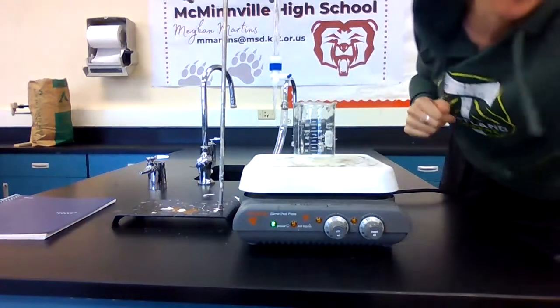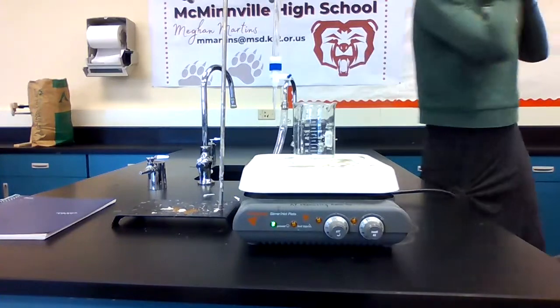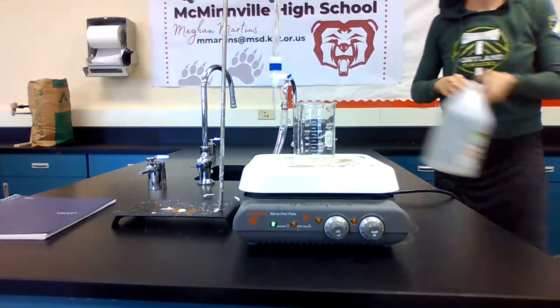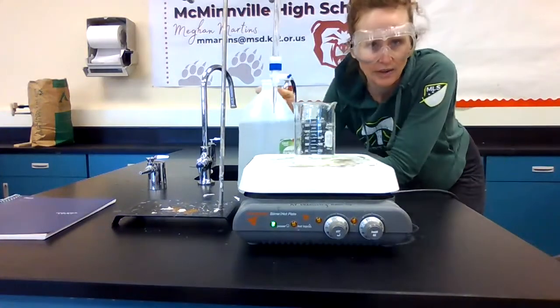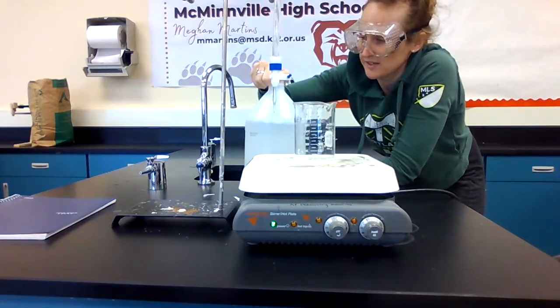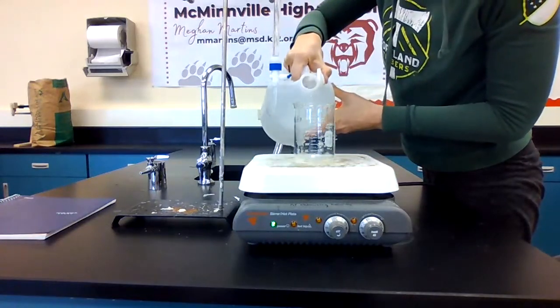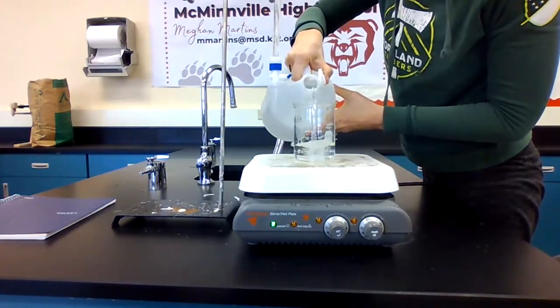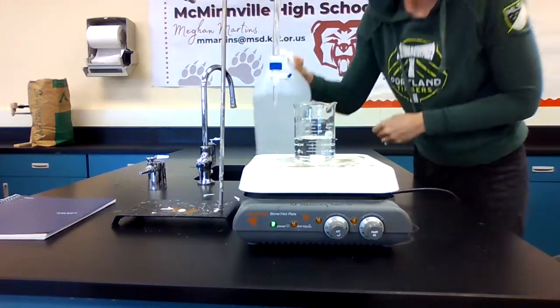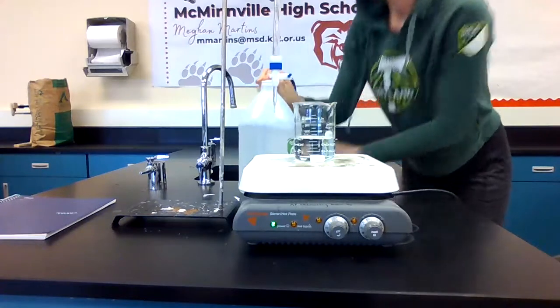So we're going to put on our safety gear, and then let me add in our first amount of liquid. We're going to use vinegar. Think to yourself, is vinegar an acid or a base? Vinegar is an acid. Which acid is it?